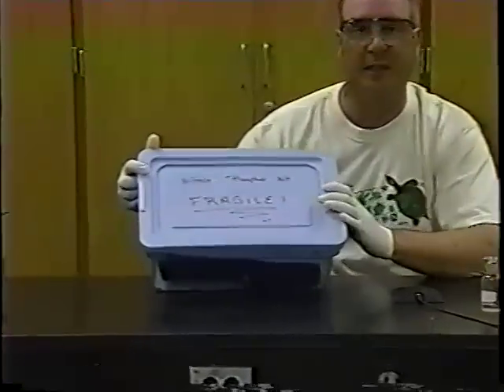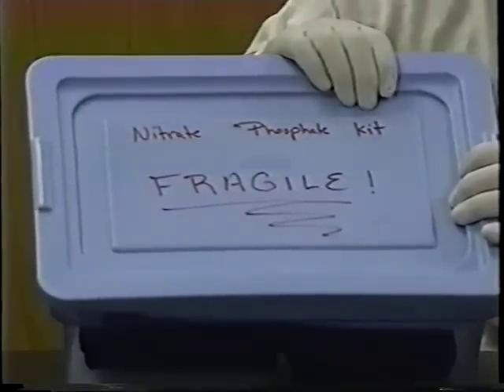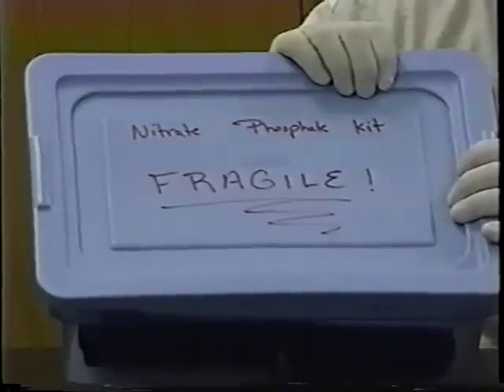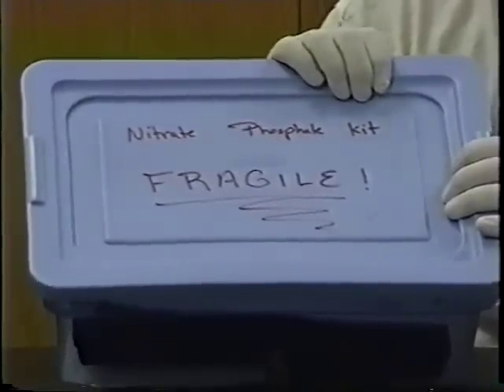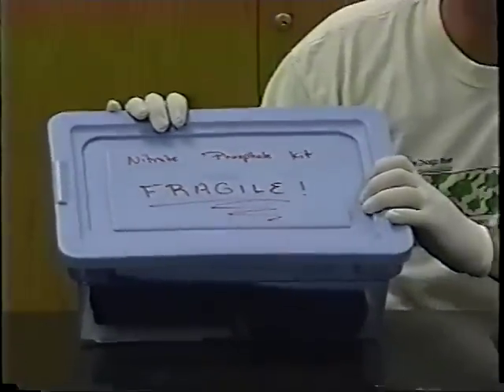Now that you have your background information on phosphates and nitrates, you want to know how to do the water quality testing. On the day of the water quality test, your kits are put together in a little carrying case. This is the nitrates and phosphate kit. It's very important that you take this with you on the day of the field trip — that's one of your responsibilities besides having your safety equipment on. Make sure you have this along with your journals.